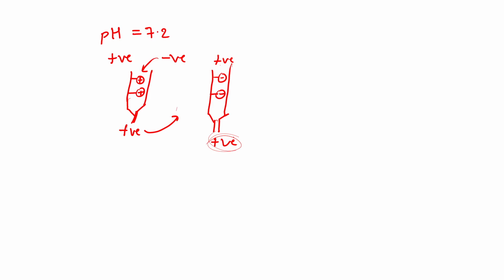Now, to further separate those, I can move on to a technique called HIC, that is hydrophobic interaction chromatography.